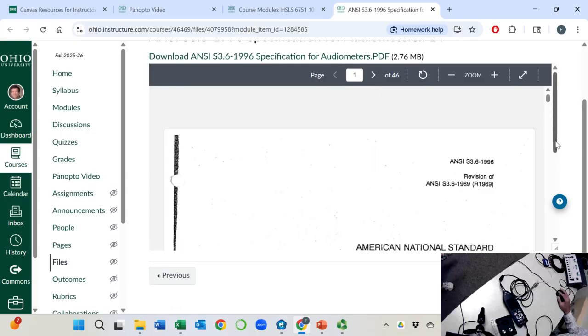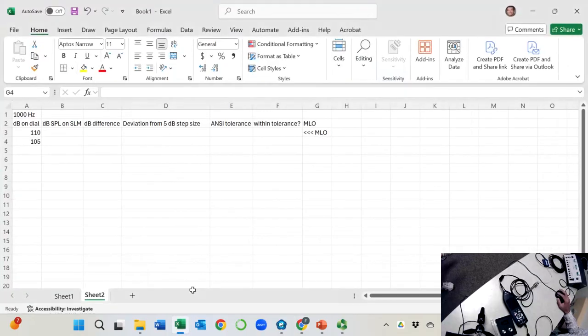And we are going to, okay, let me do the Excel spreadsheet first, and create a new one.